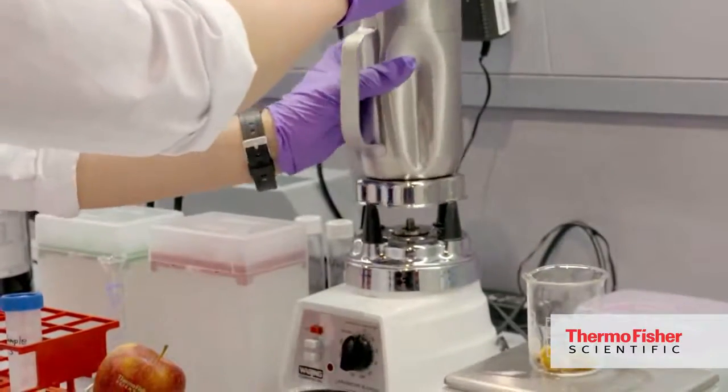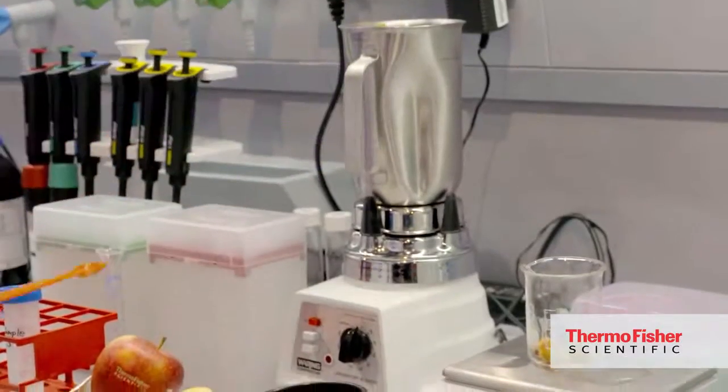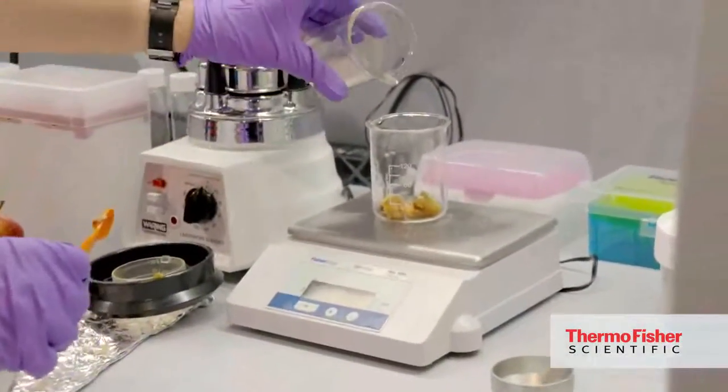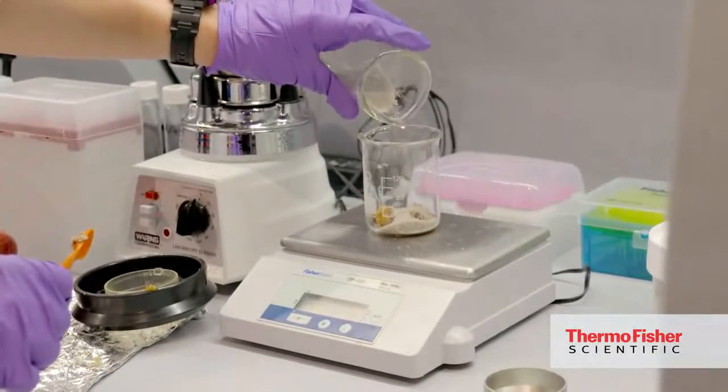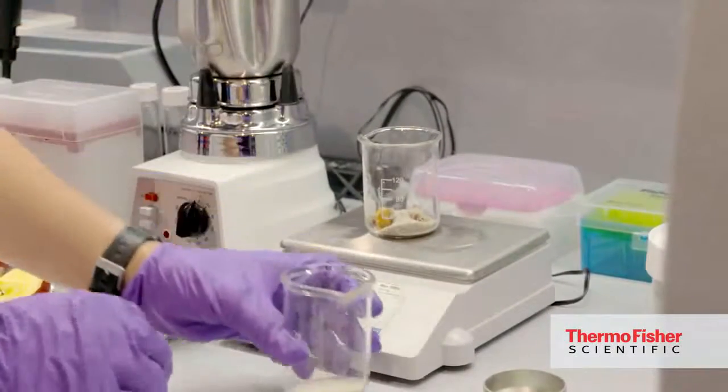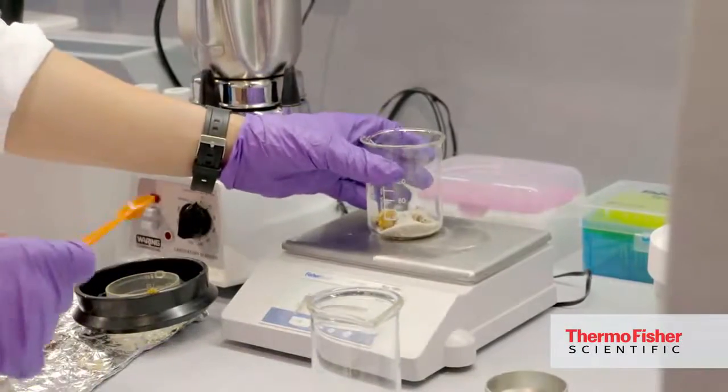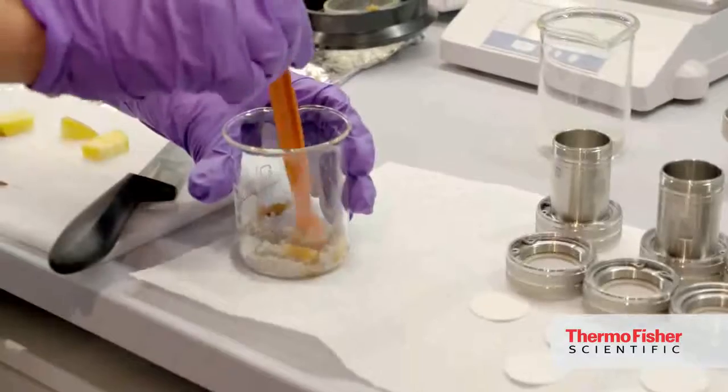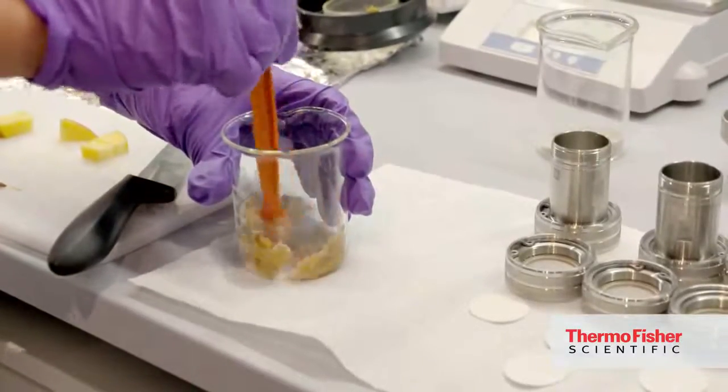And for the accelerated solvent extraction we need this dispersant. This has to be added right now in a ratio of more or less four sample units to one dispersant unit. This is what was done. This has to be mixed, carefully mixed, so that it's more or less homogeneous.